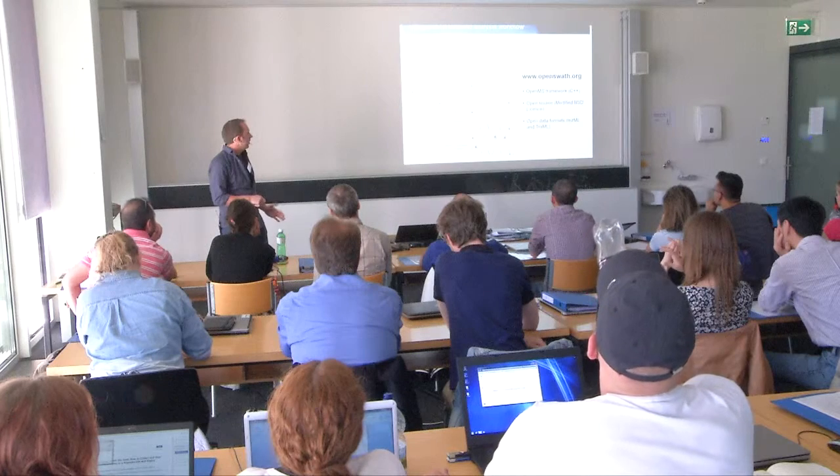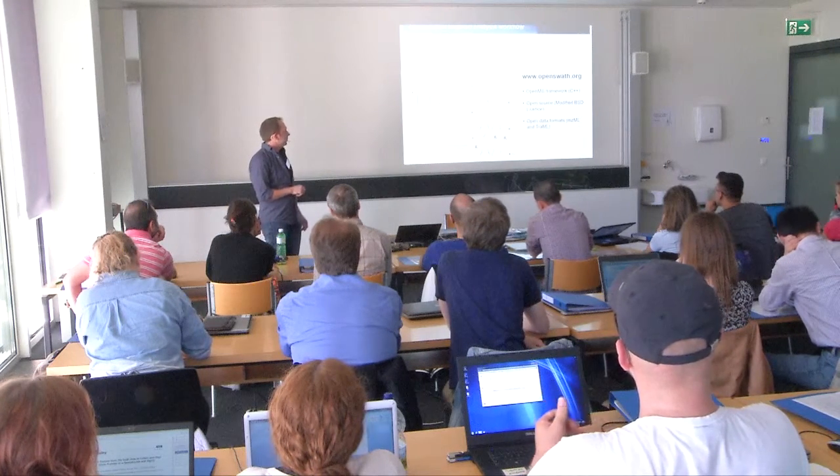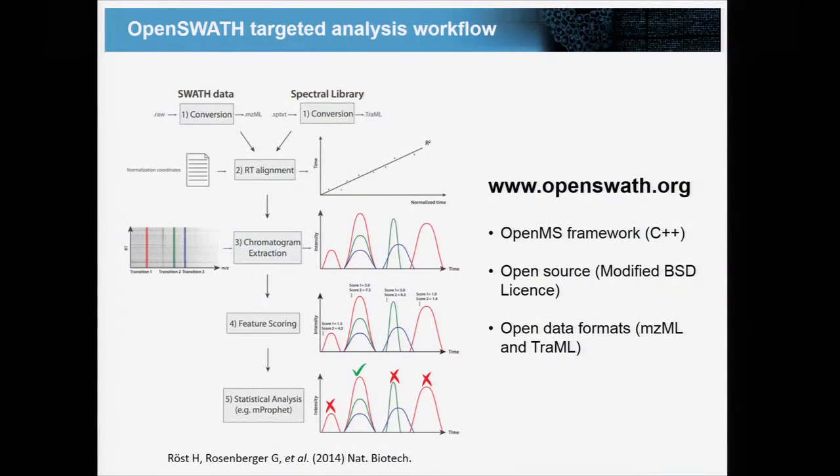It could be big or small. We do feature scoring. This is exactly what Ludovic described this morning, except he described it in SRM terms. I'll mention a little bit more detail about the scores. And then a statistical analysis based on mProphet, based on the mProphet idea, also exactly as Ludovic described this morning.